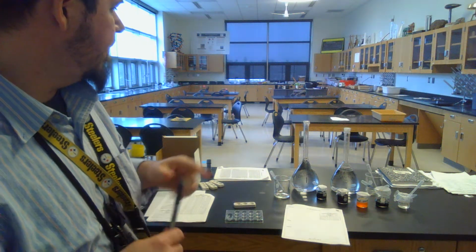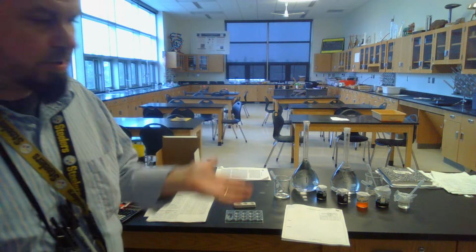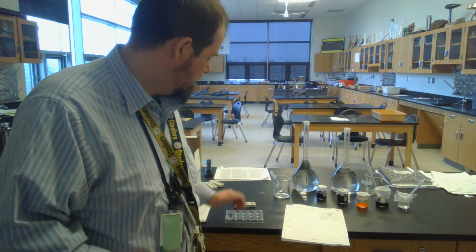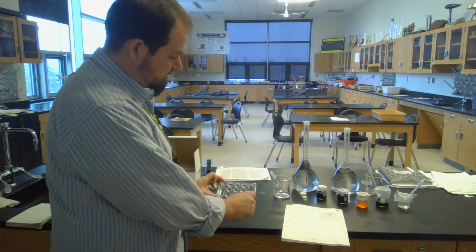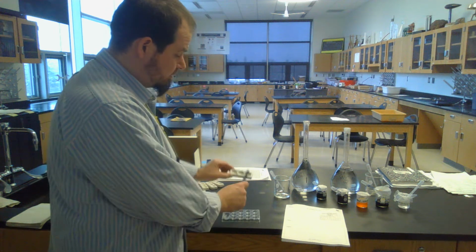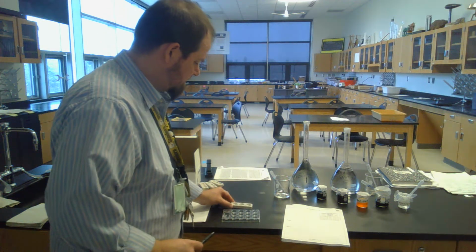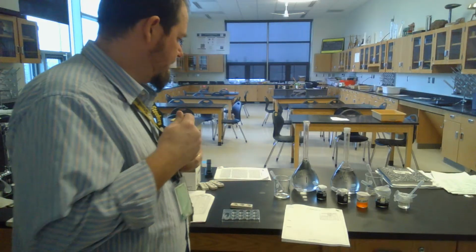I will let you know that one of these solutions is an acid and one of them is a base. So you should get 2 different results, and that's why we don't want to mix them up, but you can use the same well plate again as long as you stay in the row. So you can use these 4 as solution 1, go down here and use these 4 as solution 2. Okay, and if I use this as solution 1, I'm probably going to use this one over here as solution 2. Makes sense. Keep them as far apart as possible. Got to keep them separated. And that is indicator lab.